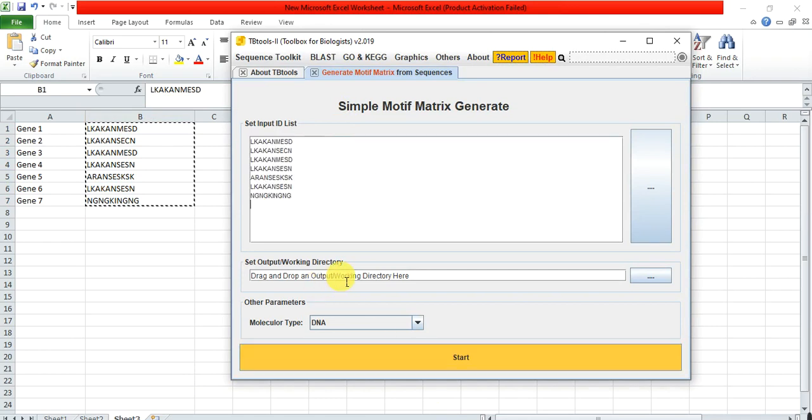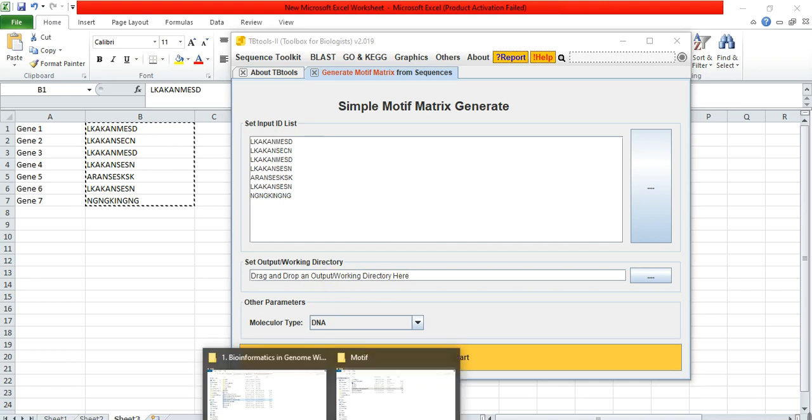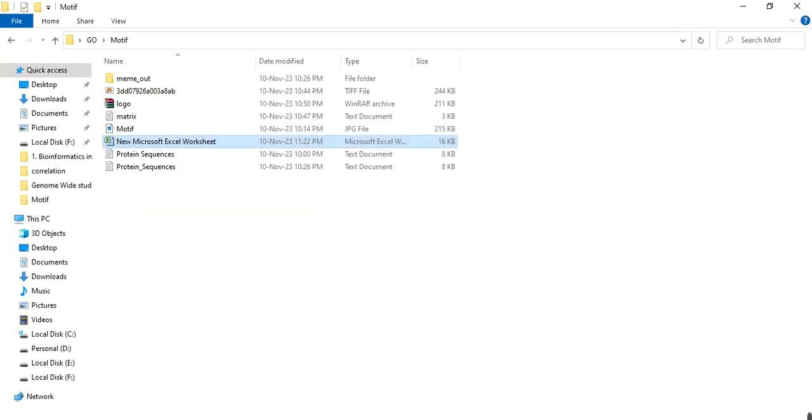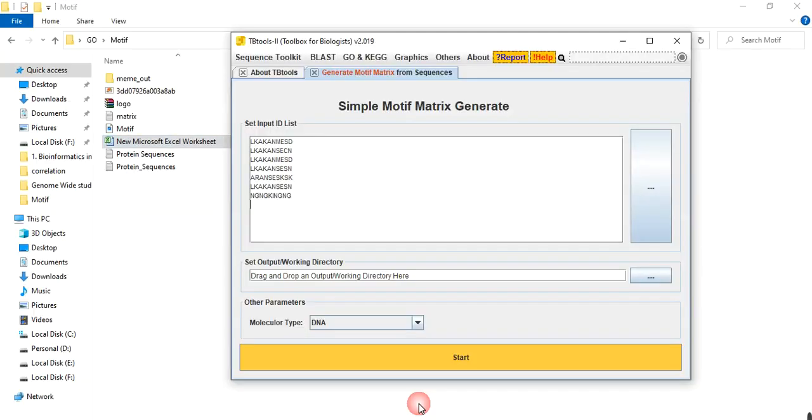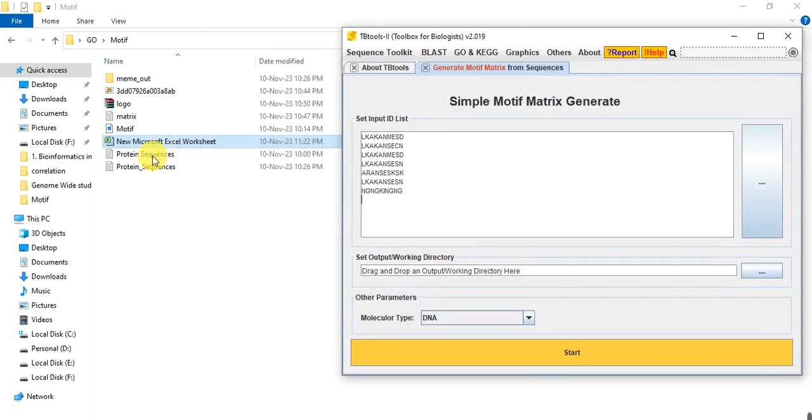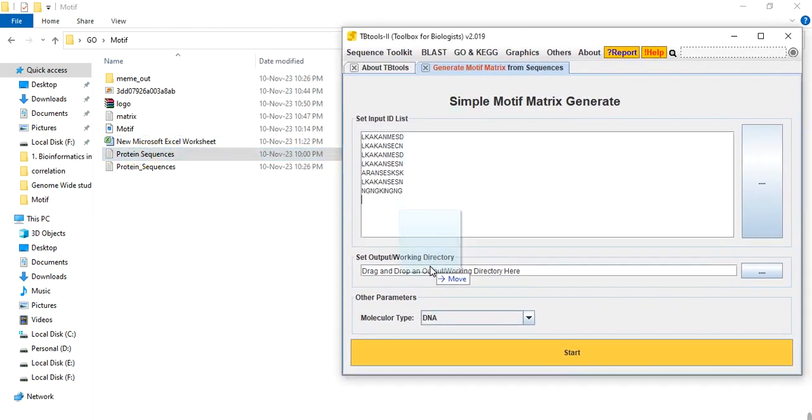Here give the output directory or where you want to save your position weight matrix of each amino acid. I want to save here, give matrix motif.txt file.